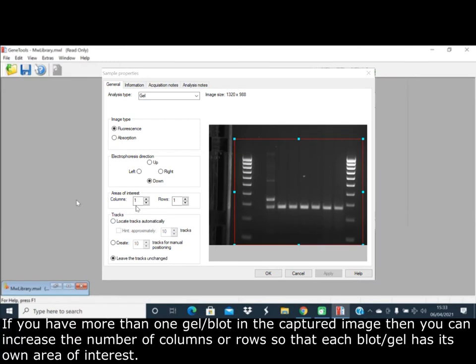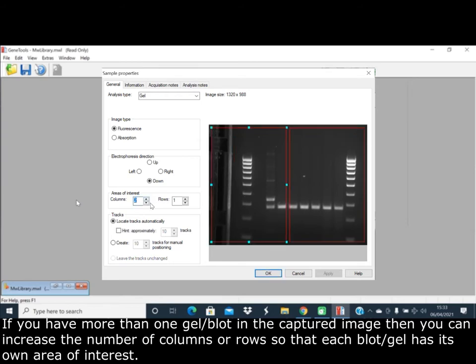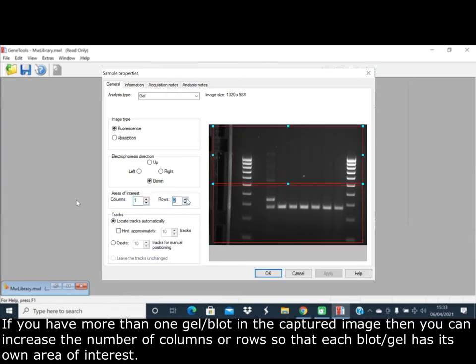If you have more than one gel or blot in the captured image, you can increase the number of columns or rows so that each blot or gel has its own area of interest.